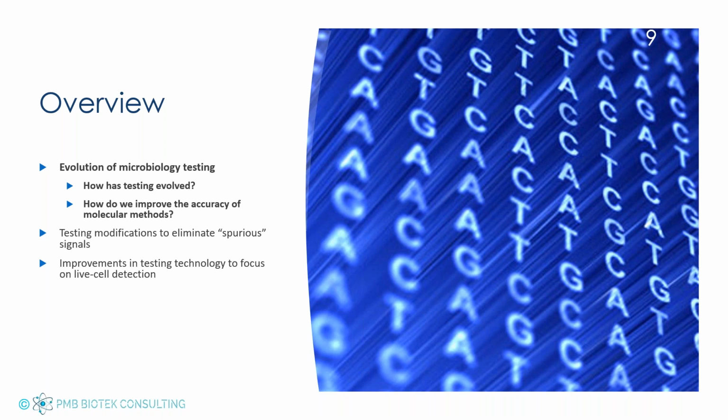And then, very briefly at the end, I just want to bring to everyone's attention, just some non-molecular technologies that people may start thinking about using in their facilities. So whether they're either non-traditional or they potentially could offer some advantages, and I'll speak to why there could be some advantages to them.